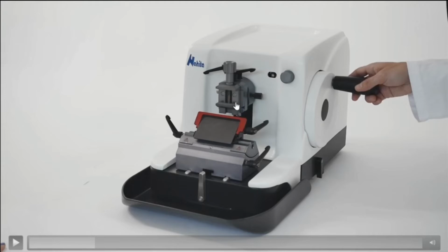here, a clamp holder is there, and in this holder we are placing the block carrying the specimen. By the rotation of the rotating wheel and the movement of the feeding screw, this part moves towards the front side, and the knife is situated here. So as a result of rotation, this part moves towards here and gets cut by the knife. So let's see that.